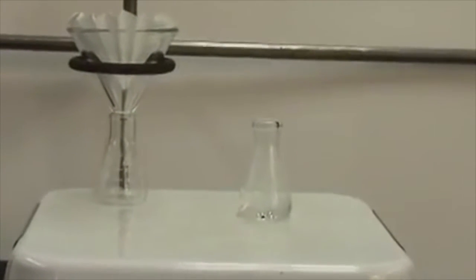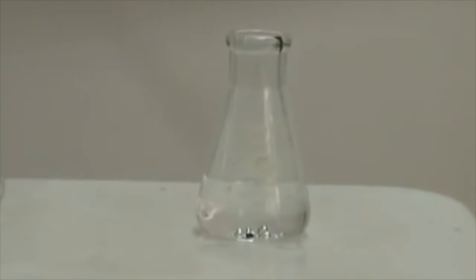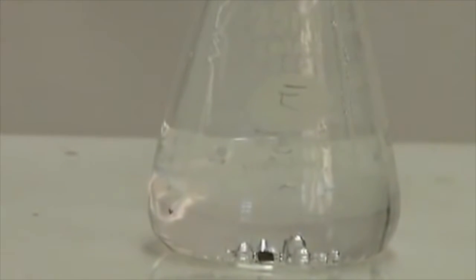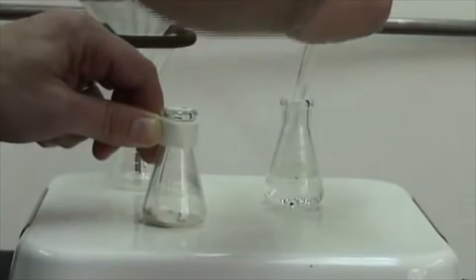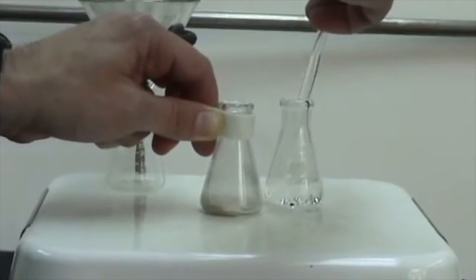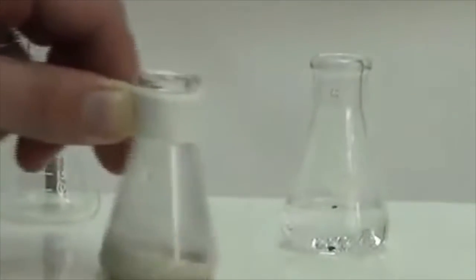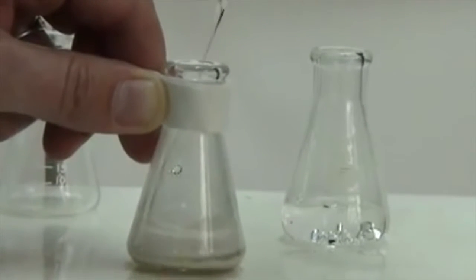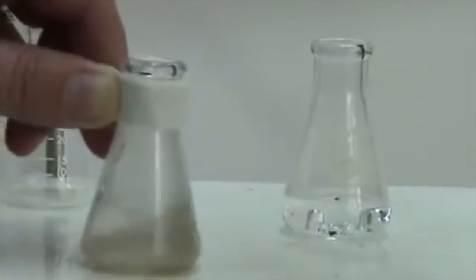First, we begin by warming the recrystallizing solvent and the filtration apparatus on the hot plate. We want to adjust the hot plate so that the recrystallizing solvent is just barely at a boil. We need to work on the hot plate so we keep everything near the boiling point. We add a couple portions of the solvent to our compound, and we need to swirl the flask keeping it in contact with the hot plate to help dissolve the material. The goal is to add just enough solvent to make a saturated solution and then a little excess. Some impurities will be completely insoluble, so don't add too much solvent.